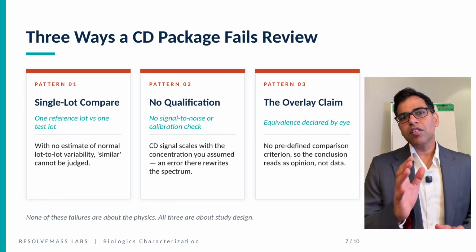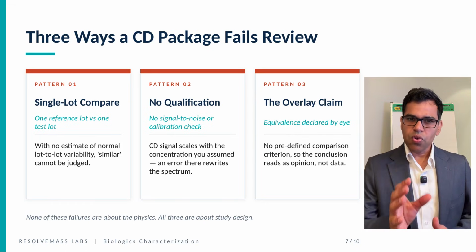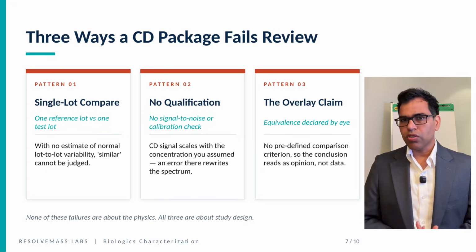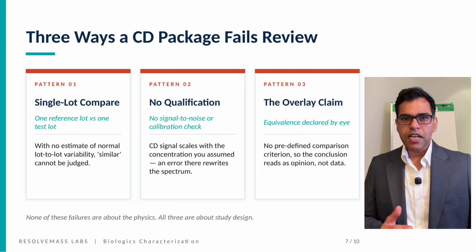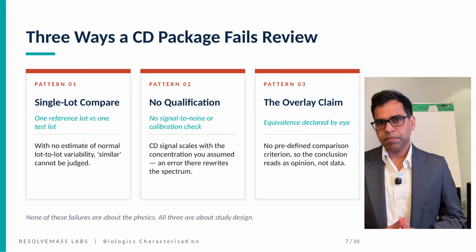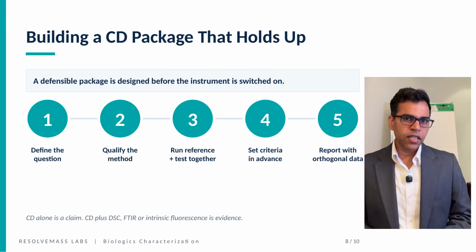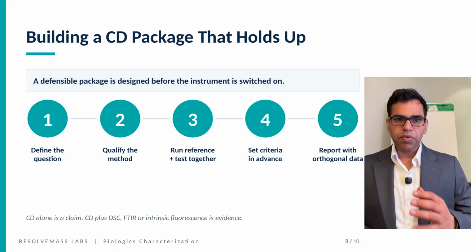Second, an unqualified method, no signal to noise, no calibration check, no accurate concentration measurement underneath it, and CD signal scales directly with the concentration you assumed. Third, overclaiming, structural equivalence declared from spectra that overlay by eye with no criterion defined. At Resolve Mass, we have rebuilt higher order structure packages that were scientifically sound and still got queried purely because nobody wrote down what comparable means before the data existed.